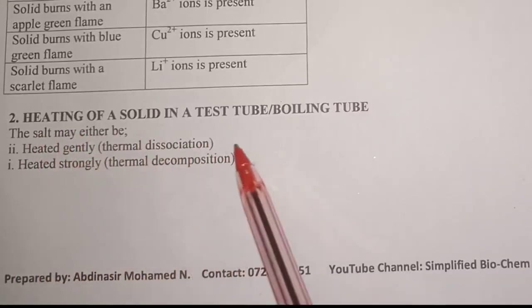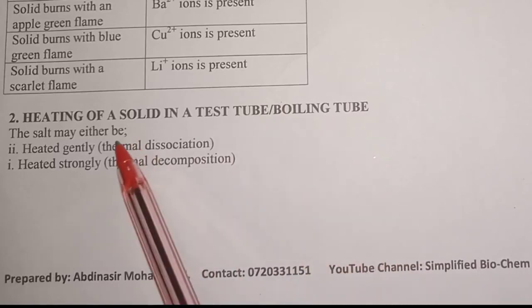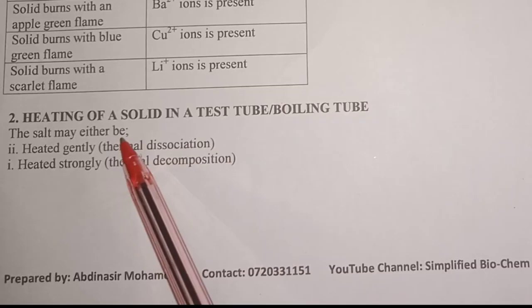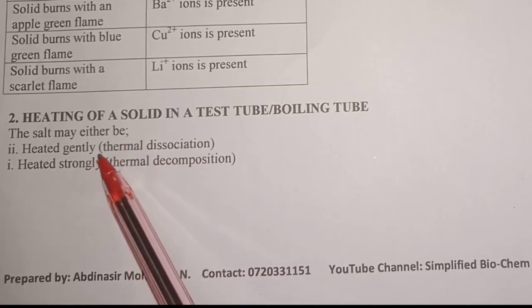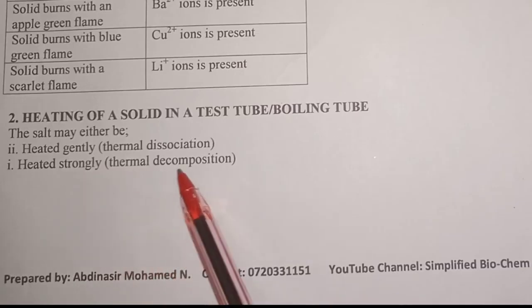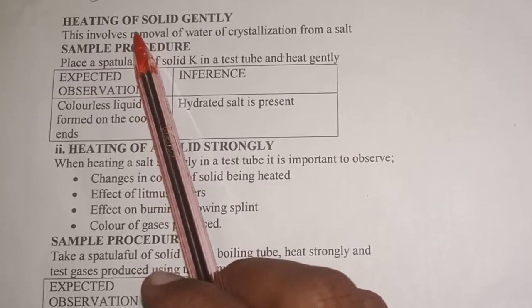Next is heating of a solid in a test tube or a boiling tube. The salt which is heated here in the boiling tube or the test tube may either be heated gently, that is thermal dissociation, or strongly, that is thermal decomposition.